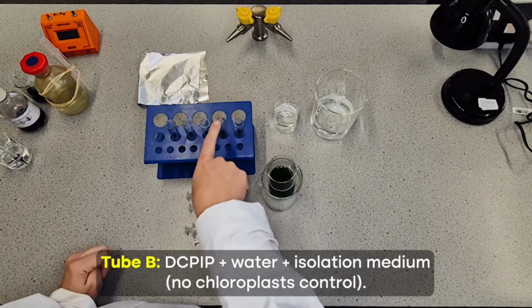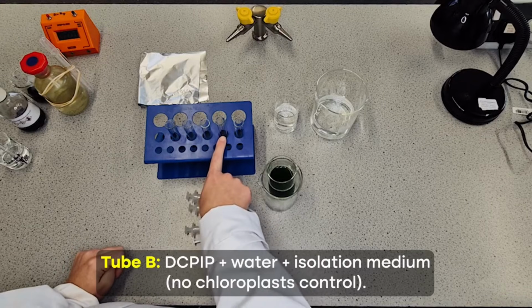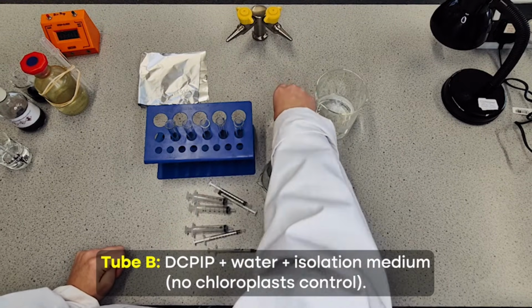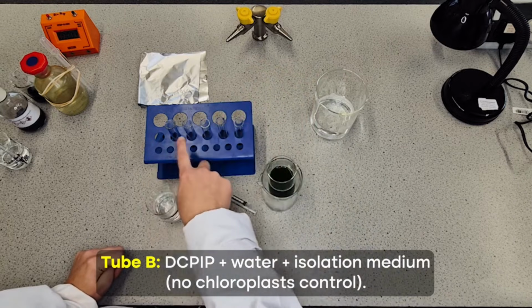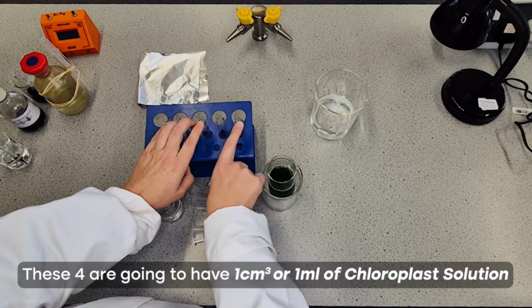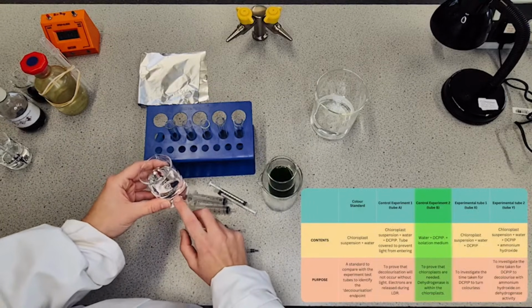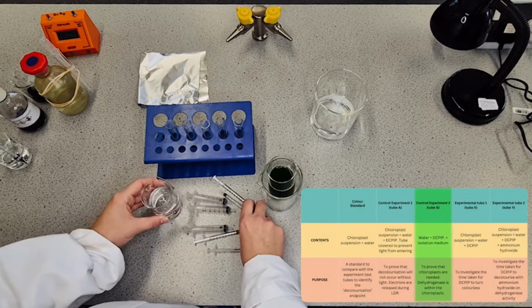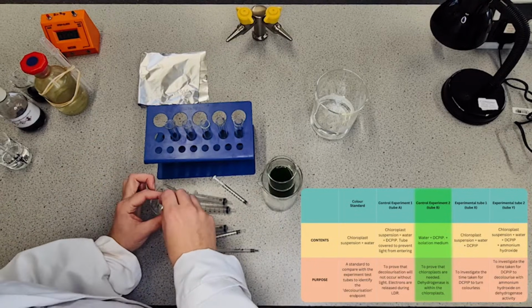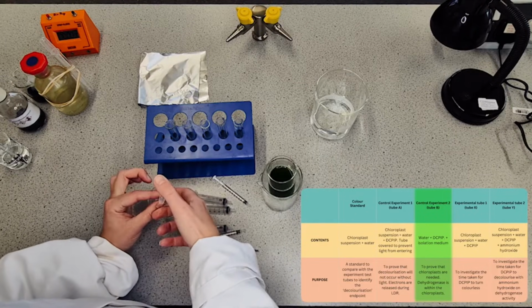Tube B isn't going to have any chloroplasts in because this is going to be our second control tube where we're proving that the reaction doesn't happen unless you have chloroplasts present. But again, because we need the same volume in all of them, these 4 are all going to have 1 centimeter cubed or 1 milliliter of this chloroplast solution. So B is just going to have the isolation medium that the chloroplasts were blended in, to prove it's nothing about the isolation medium causing the changes, and it is the chloroplast suspension.